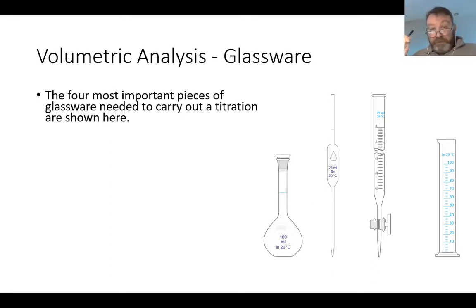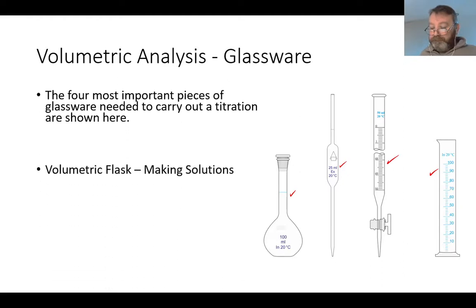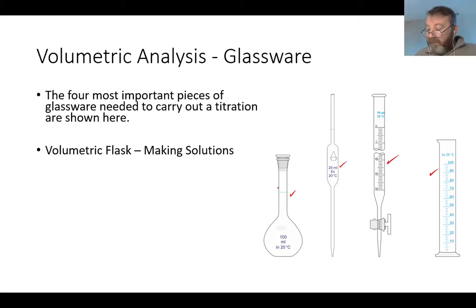Looking at the four most important pieces: you might recognize the graduated cylinder and the burette; some of you may remember the pipette; and very few will have seen the volumetric flask. The volumetric flask is used for making solutions. If you look down the neck, there is only one mark — and you must fill the liquid to that mark to ensure you have the correct solution.